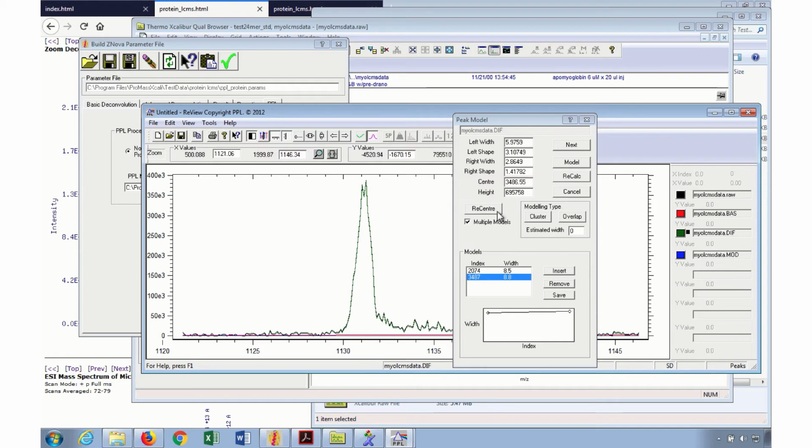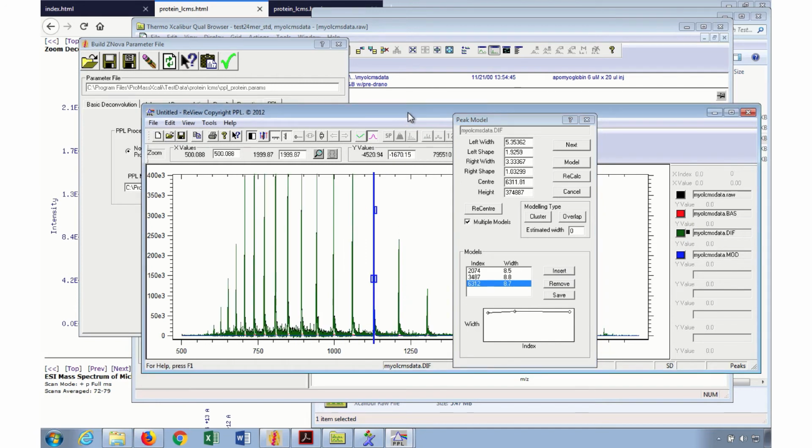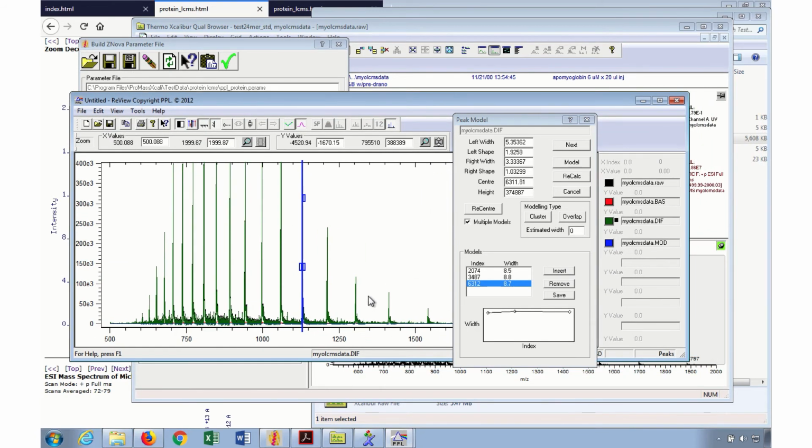So we'll see what we end up with here. Generally what you find is it'll be on a line or it'll be a slight curve or something, but in that case, if the line is steep enough or there's enough curvature, then it's probably useful to have multiple models. So again, I'm just making my way across here, and you can see there's actually not much happening. It's staying fairly constant.